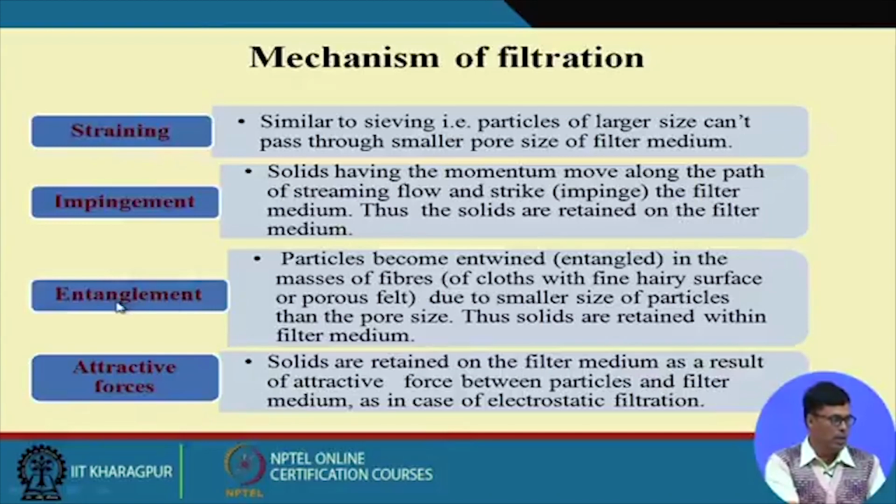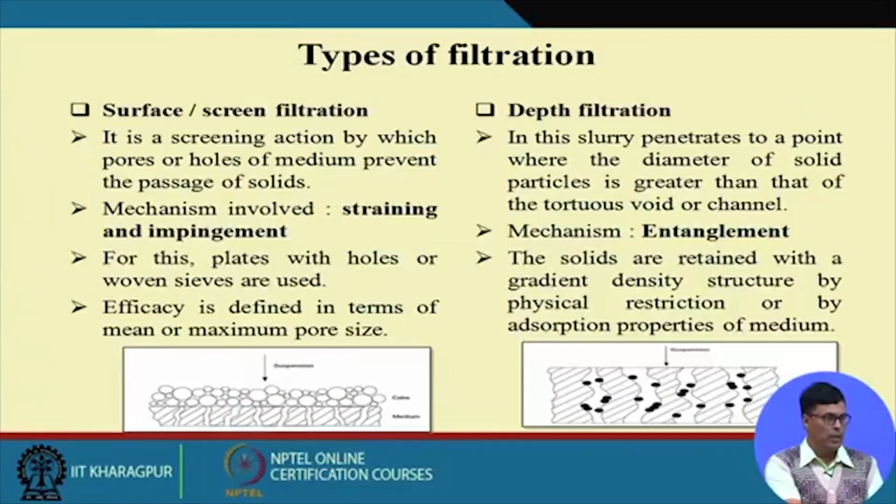So this is the entanglement, where the particles become entwined. They are entangled in the mass fiber due to the small size of the particle relative to the pore size. Thus the solids are retained within the filter media. Attractive force: solids are retained on the filter media as a result of attractive force between the particles and the filter media, as in the case of electrostatic filtration. If your particle has the opposite charge, then you can easily separate it by attracting the opposite side, and other things will be filtered out.